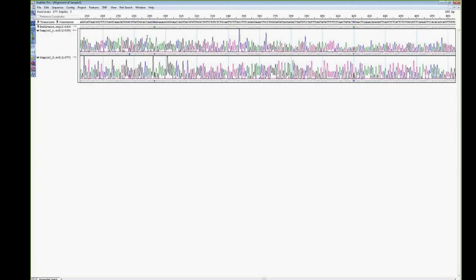So that's just a really high-level overview of SeqMan Pro. It combined de novo, single sample, and reference-guided multiple sample. But you can do different combinations of the 2 workflows depending on your needs. So at this point, I'm going to talk about our final workflow, which is multi-sequence alignments and phylogenetic trees.